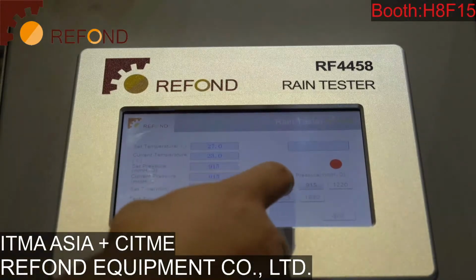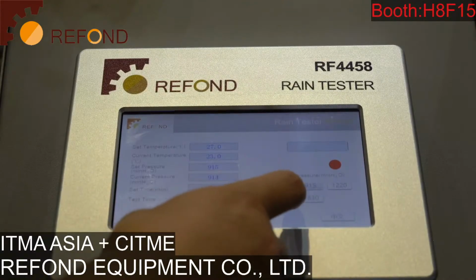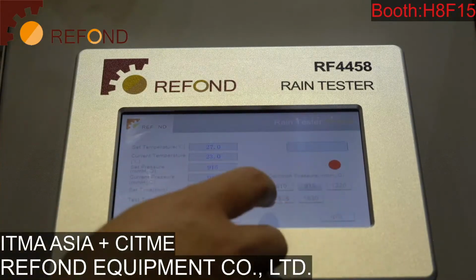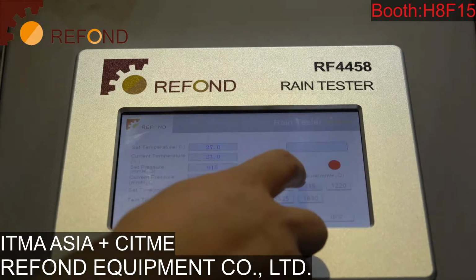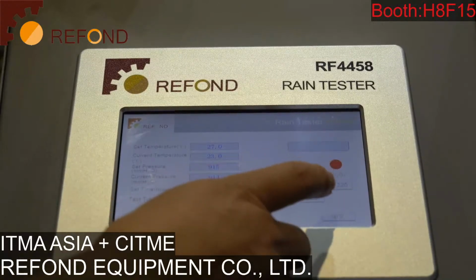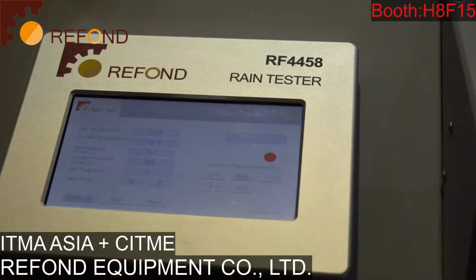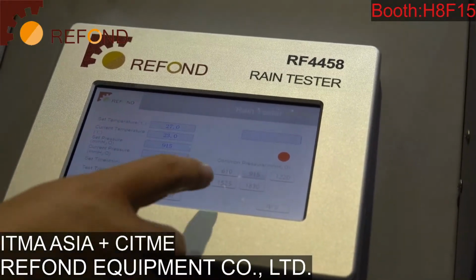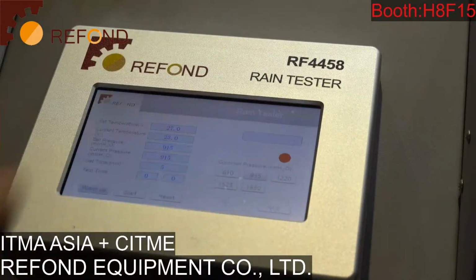You see on the right side they have 1, 2, 3, 4, 5. They have 5 fixed values for the water pressures. Because these water pressures are indicated or requested by the AATCC testing standard. So we have entered all these water pressures inside our system. It is for easy use of our testing.